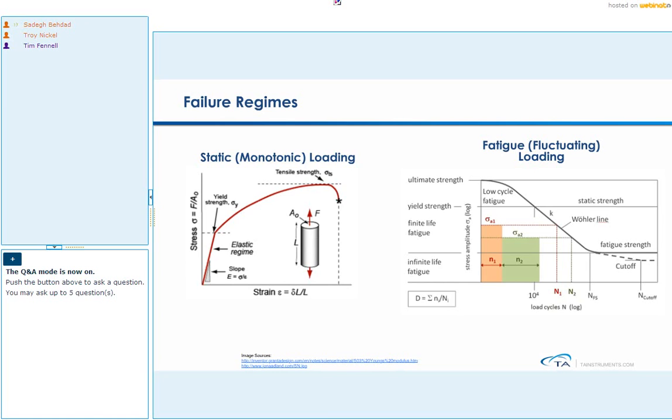We call that first section the elastic regime or elastic behavior, and the second part, post yield, we call plastic deformation, if you're talking about solids here. Then you have material that is storing some of the energy and dissipating some of it. And then you pull further and further until you get to your ultimate tensile strength, after which your sample is going to be broken.